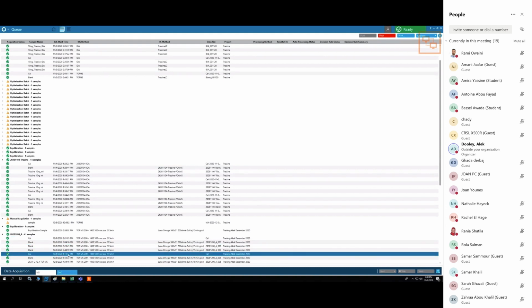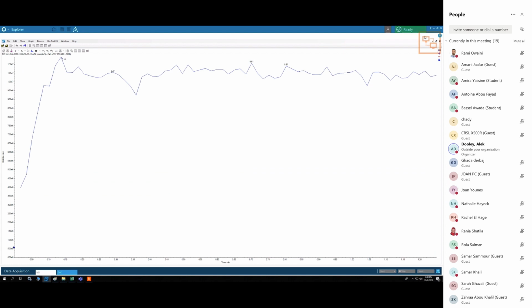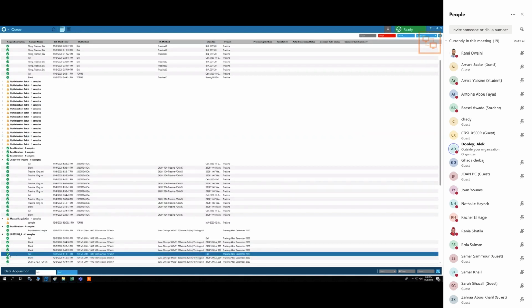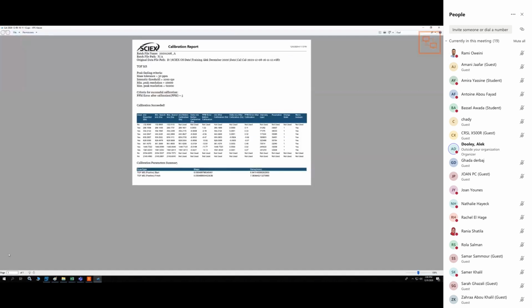Okay, so yes, but so I think my next point is exactly what you were saying. Let's open the second calibration. And oh, whoops, I double-clicked the wrong thing. My mistake. I will double-click correctly now, the check mark. So here we can see, now we have before calibration. So it's also not so great. So yes, probably what happened is the instrument warmed up because it was not used for a month.